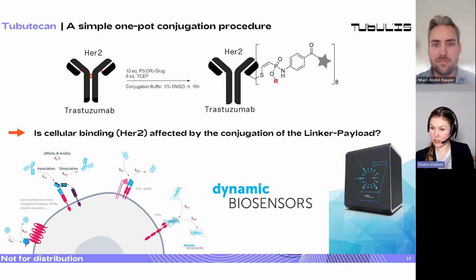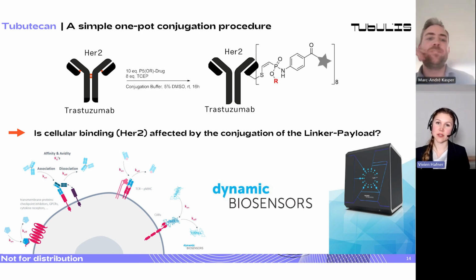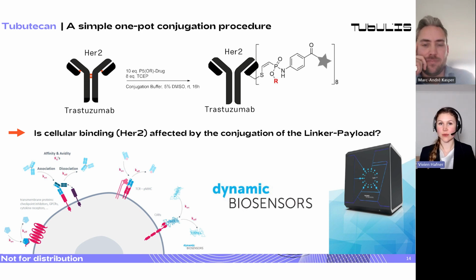And there's also a question about internalization, whether we saw any internalization during the measurements of these ADCs. Internalization is something we are very strongly looking into at the moment. Of course, it's a bit difficult to tell because the fluorescence will still be detectable whether it's outside of the cell or in the cell. So we cannot really differentiate whether something is just binding very strongly or whether it's internalized.